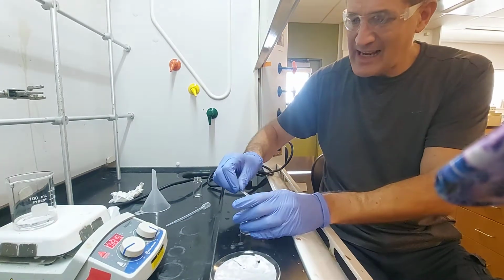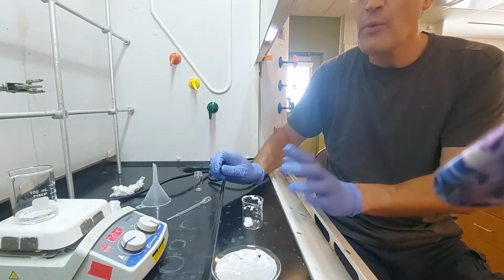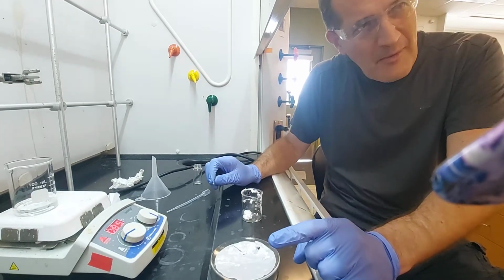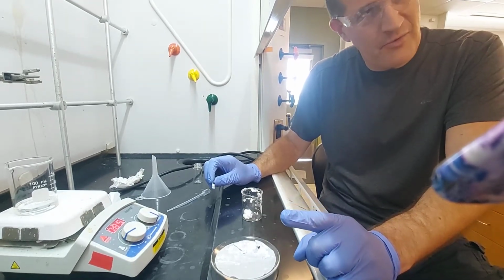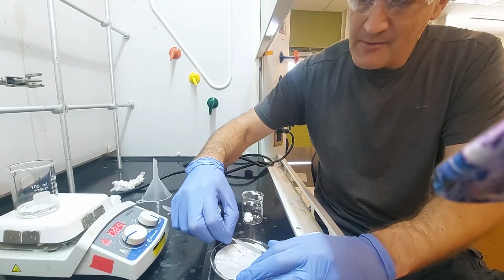All right, and I'm just going to get this off as much as I can. So when you guys do this, will their sample have been dried for a week? No, their sample won't have been dried for a week, will it? Well, if they're going to scrape it into a 20 ml vial, but yeah.